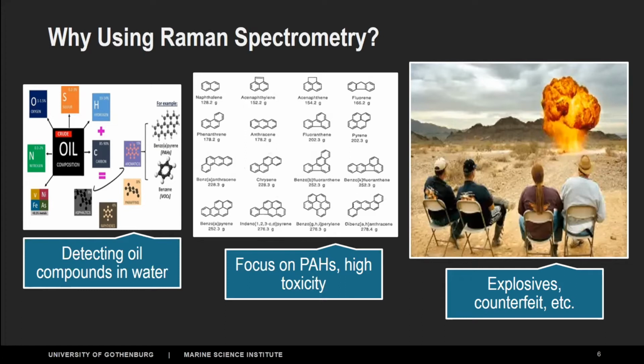So we have really good data from sediments with these PAHs, but we want to detect them in water because they're in such tiny amounts. And I'm working with pyrene again, which has 4 benzene rings, is number 8, the second row, last one to the right. And of course, they are components of oil. If we want to detect an oil spill, of course, we are going to look for PAHs.